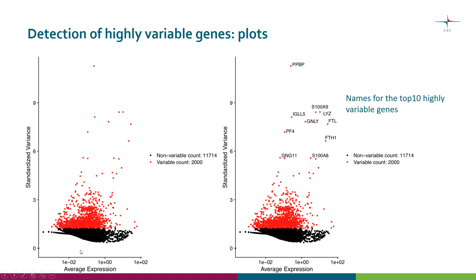Now the plots look different. On the x-axis we again have average expression, and each dot is a gene. On the y-axis we now have the standardized variance. You can see that we no longer have the strong mean-variance relationship — this line is more or less flat. The Seurat tool has colored those 2000 genes with the highest variance in red. In the second plot, it is exactly the same except that the 10 most highly variable genes have also been named.